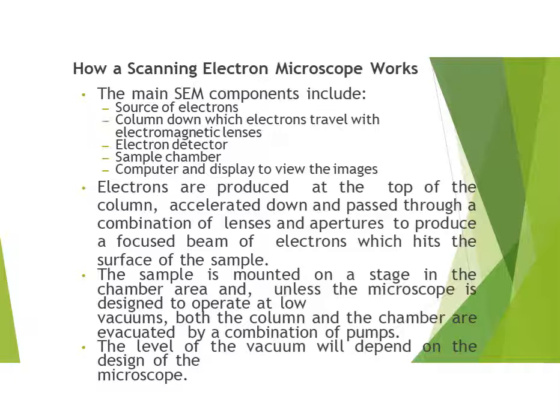The sample is mounted on a stage in the chamber area, and unless the microscope is designed to operate at low vacuums, both the columns and the chamber are evacuated by a combination of pumps. The level of the vacuum will depend on the design of the microscope.